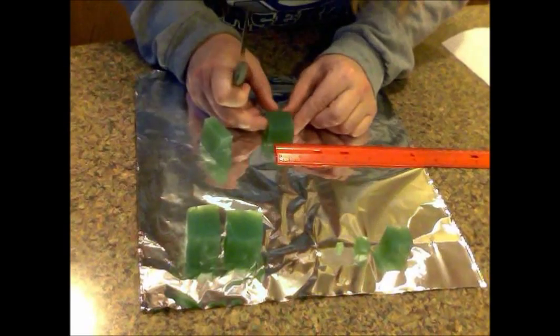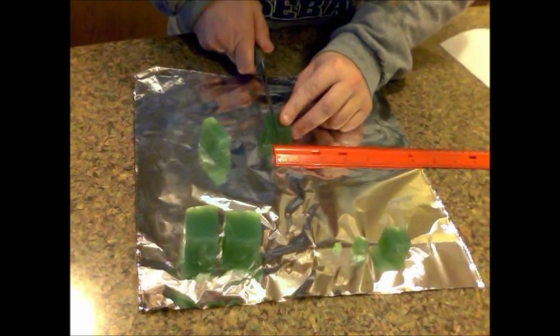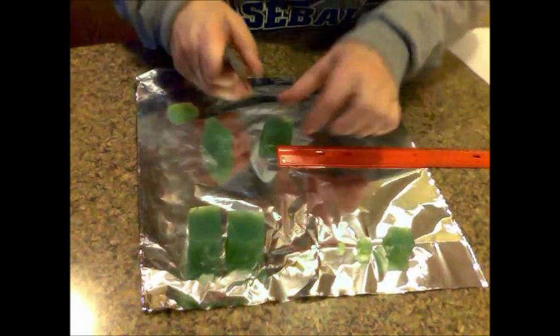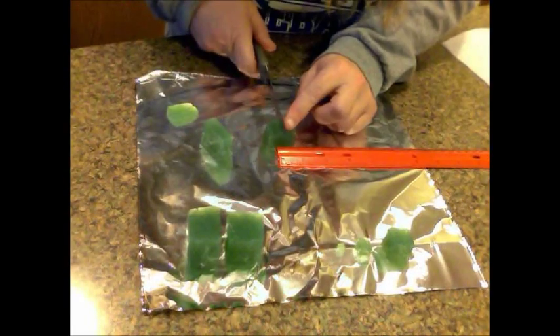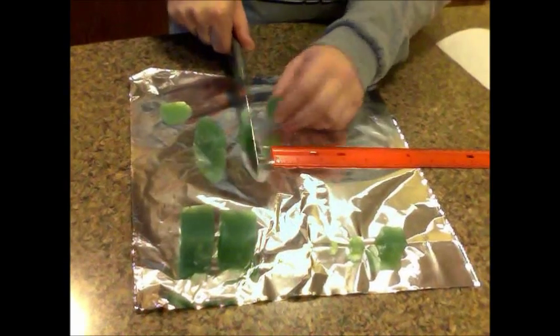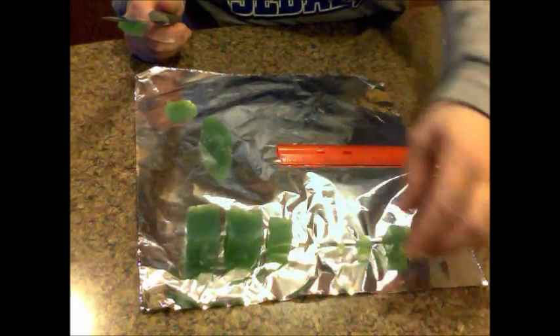Flip it around this way, again 20 millimeters or two centimeters. That should be pretty close. There's my second block — should look just like the second one.